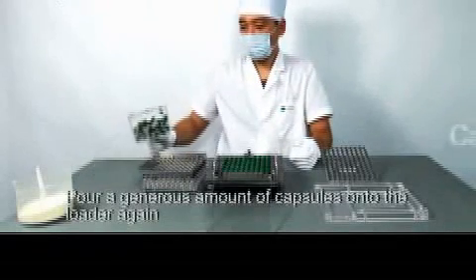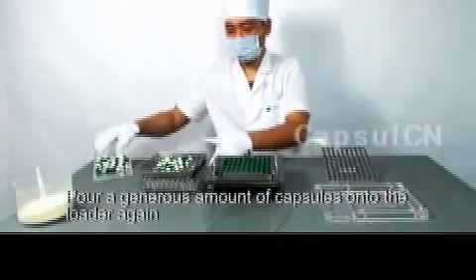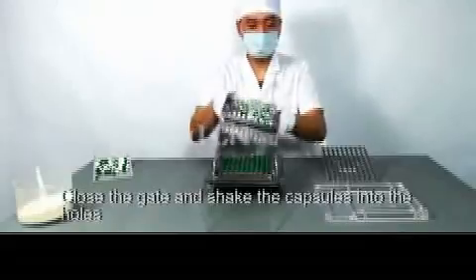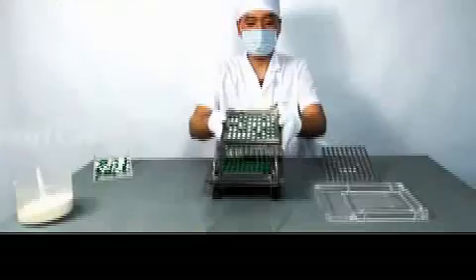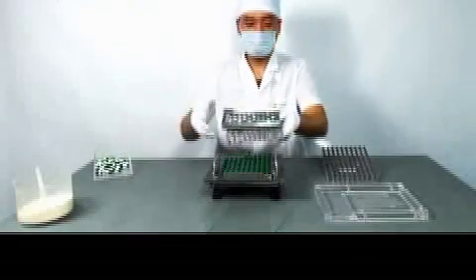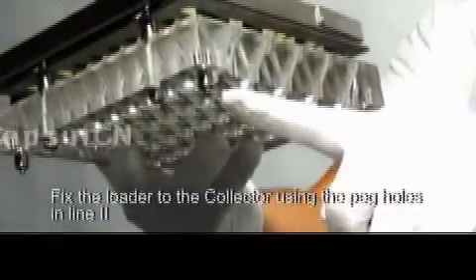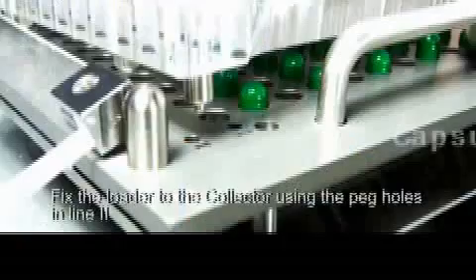Pour a generous amount of capsules onto the loader again. Close the gate and shake the capsules into the holes. Pour off excess capsules. Fix the loader to the collector. Use the peg holes in line two.